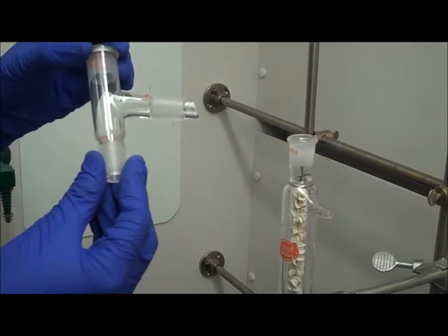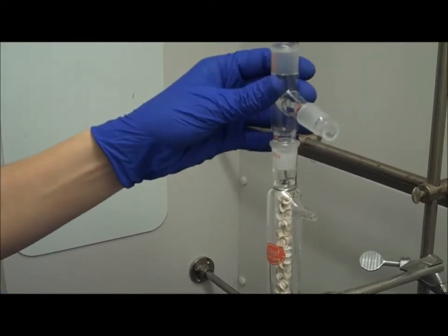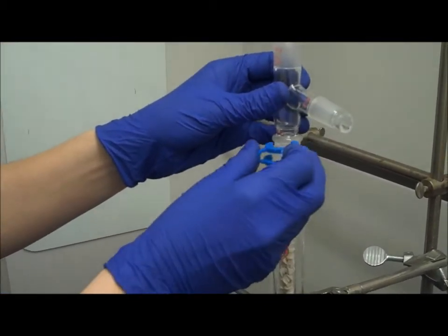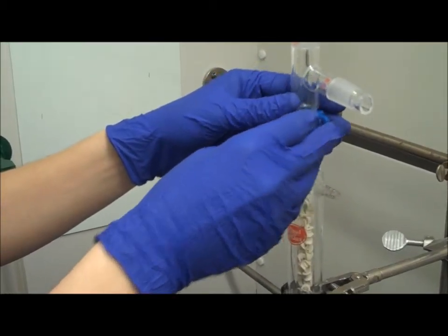This is the next piece of glasswork to be used in the fractional distillation apparatus. It attaches to the top of the fractional column. Always clamp down your glasswork to ensure you don't have glass breakage.